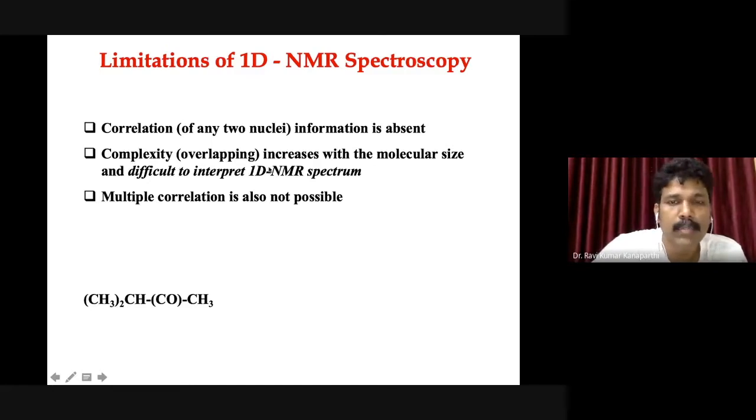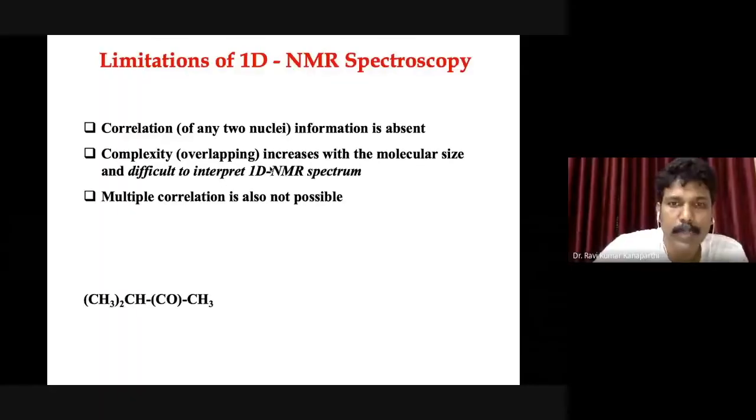As the molecular size increases, we have so many protons, carbons, nitrogens, etc. in the molecule. That makes the spectrum complex and difficult to interpret, and to get from there to the molecular structure.